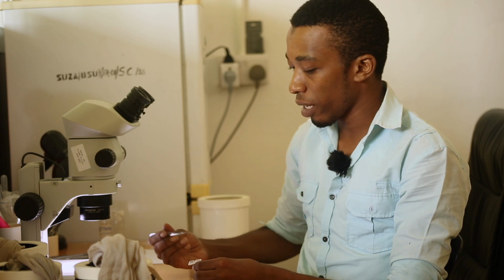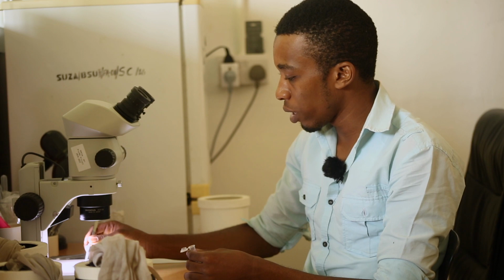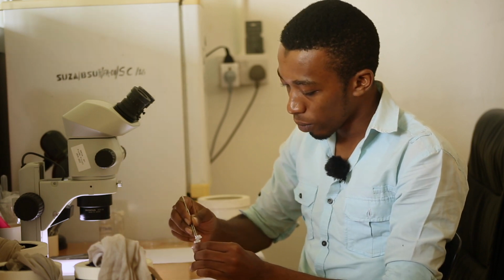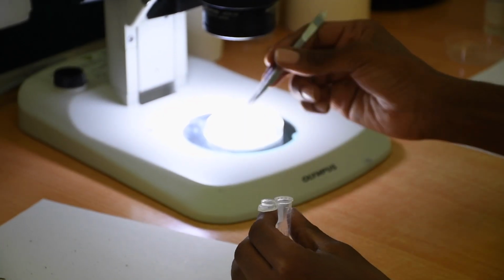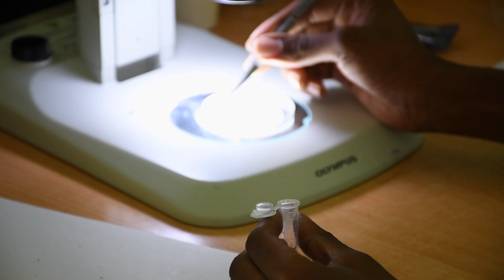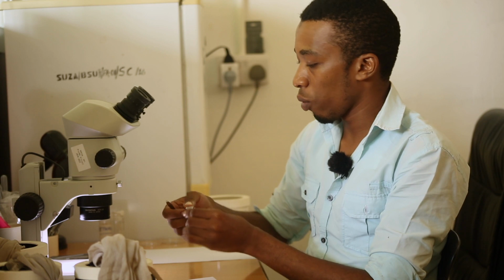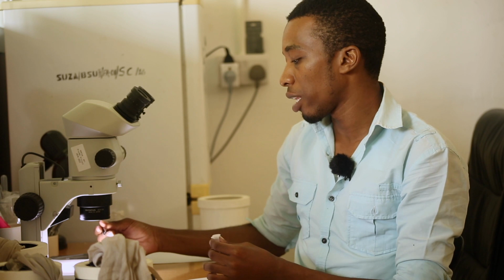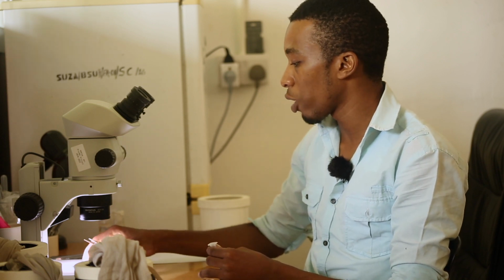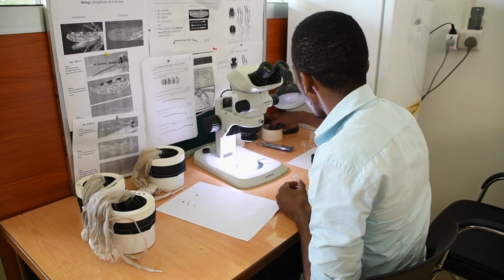So once we've separated the species into the male and female, we store the female species into the Eppendorf tube. So we use the tweezers and the forceps. Okay. Now, it depends on the type of the research question. If the male counterparts are needed, then they will be stored for further analysis, but if they're not, they can be discarded. Now we use a masking tape.